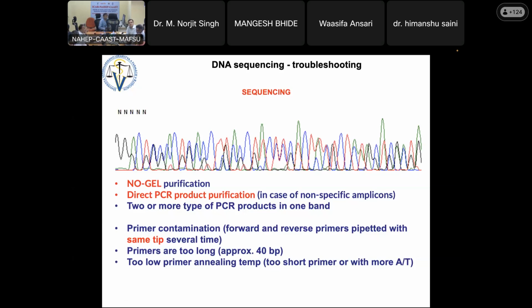Now we saw the basic principle of sequencing is to sequence by only 1 primer, not 2 primers, only 1 primer. And now you are going to send that mix, unfortunately created mix, to the company for sequencing. And always you will have this kind of mix reaction.